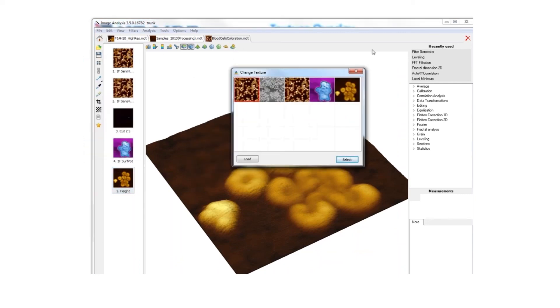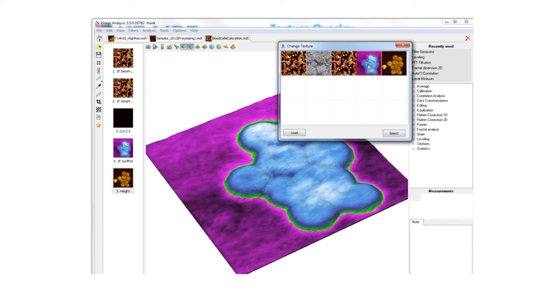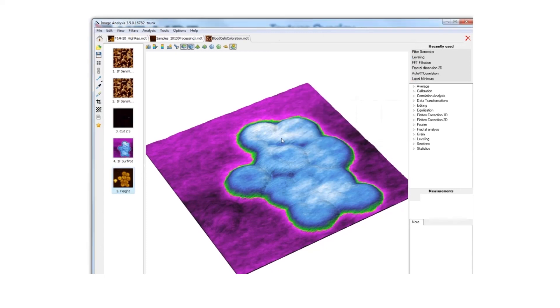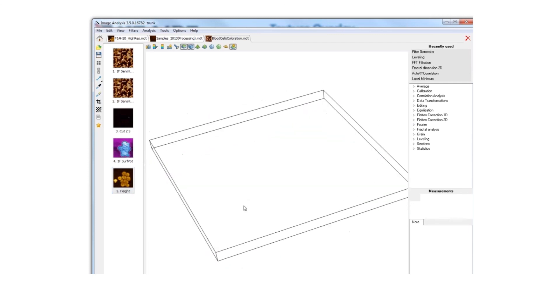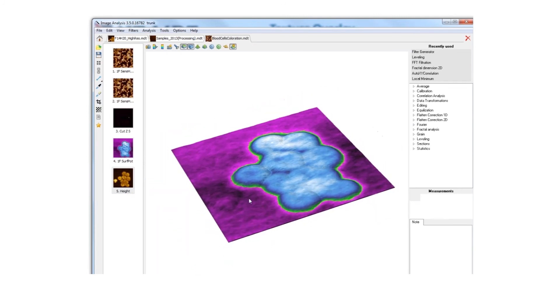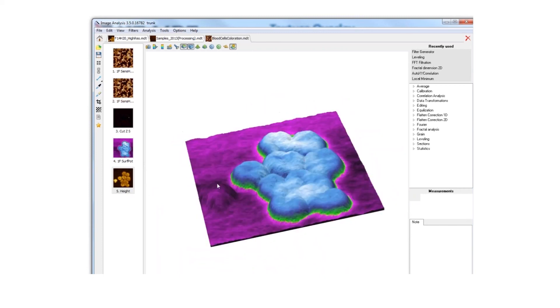I get a list of all my scans and choose the texture corresponding to this scan and press Select. I can see that the surface potential property — in this case a KPFM map, or surface potential map — is overlaid over the 3D image. In this view we can see that this feature doesn't have any dipole moment or surface potential. This is one way to explain many things in just one image.